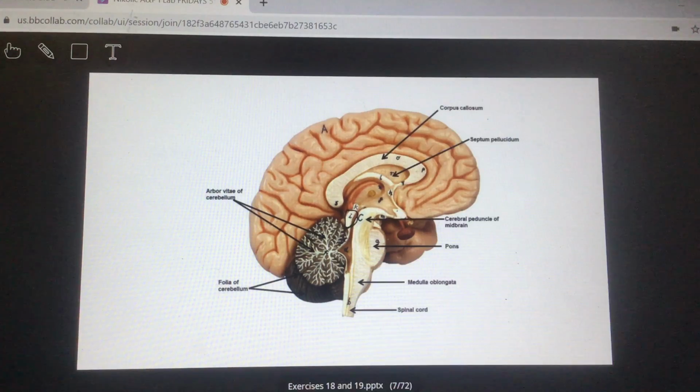Posterior to the midbrain is called the corpora quadrigemina. We're going to see the superior colliculi and the inferior colliculi on the sheep. So together, it's called the corpora quadrigemina. Okay, so midbrain. And look at this order here. In your book under brainstem on 140, it says mesencephalon, which is midbrain. Pick your poison, whichever one you like. The next one underneath that is corpora quadrigemina, superior colliculi, inferior colliculi. Just call it the corpora quadrigemina, trust me. Underneath that is called the cerebral peduncles. So let's look at that.